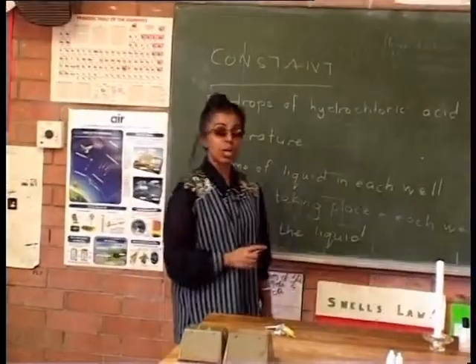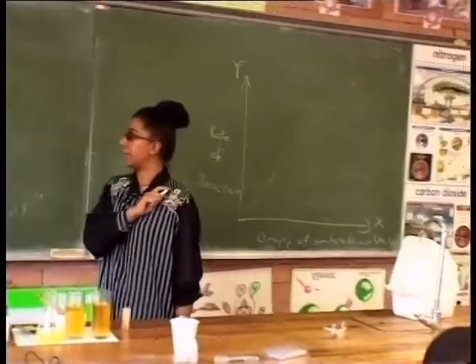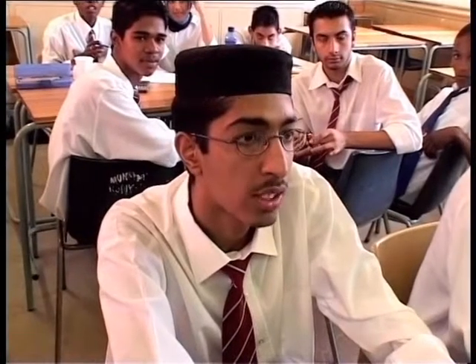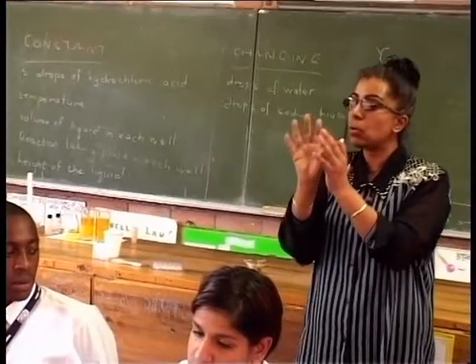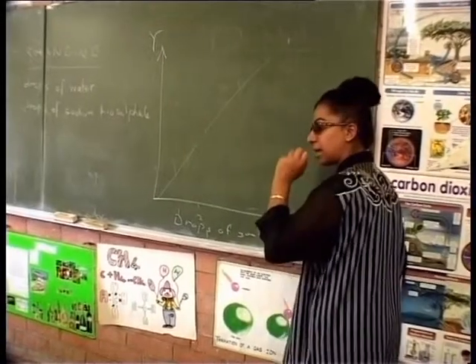Let us now check which variables were changing. The number of water drops were changing. The number of drops of sodium thiosulfate. So which quantity is this related to? The concentration.